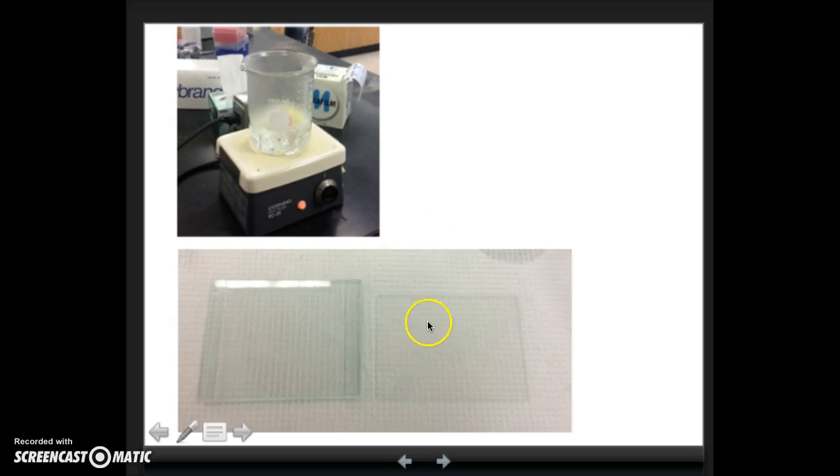Here's a sample showing you how the gels are actually poured. There's two glass or sometimes plastic plates. This one is a little bit bigger, a little bit taller than this one. There's a small spacer plate on this, so when you put this plate on top, it's separated by a very small space, maybe a millimeter in diameter. Then you pour the acrylamide of the resolving gel, and it polymerizes to form the polyacrylamide gel.